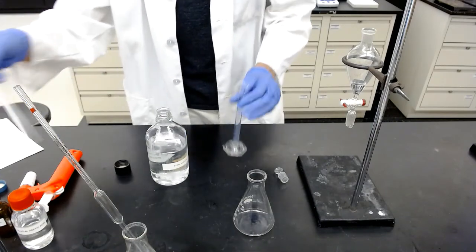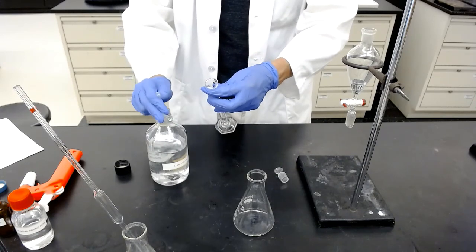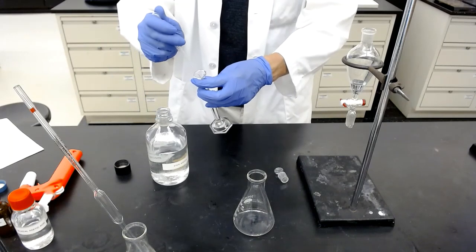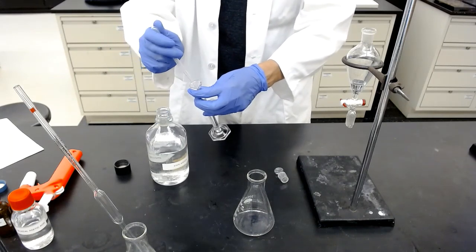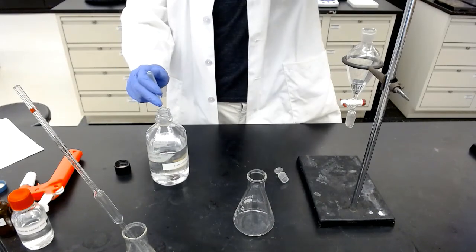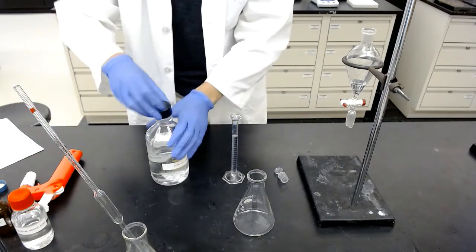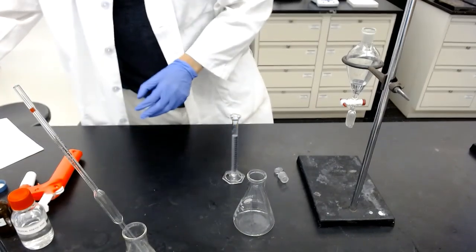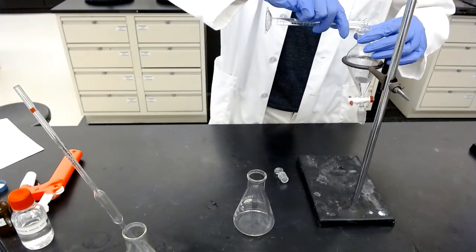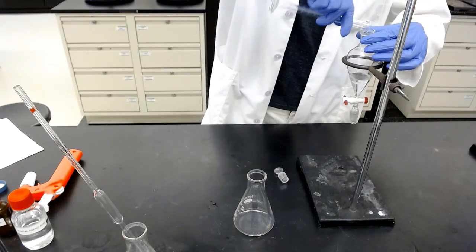So I'm grabbing another 10 mL graduated cylinder, measuring 10 mL exactly, by using a dropper to do the transfer. It's 10 mL. Alrighty. And then the ethyl acetate solution is transferred to the separatory funnel with the acid solution, 10 mL each.